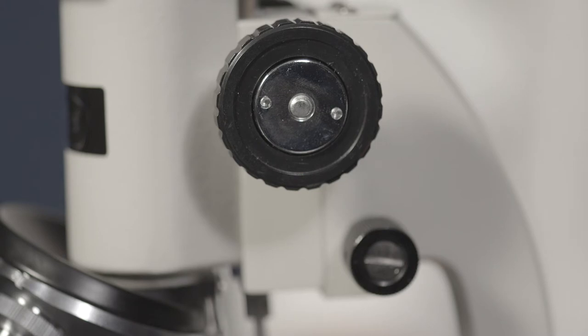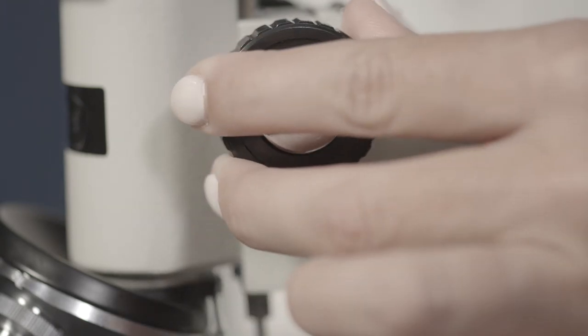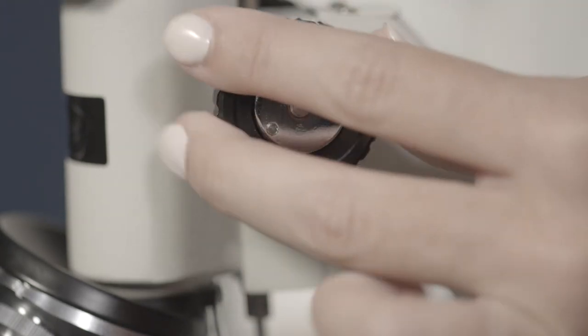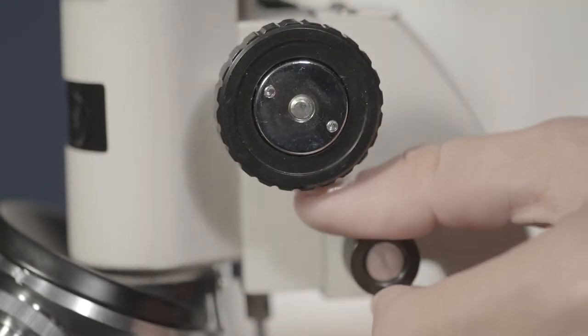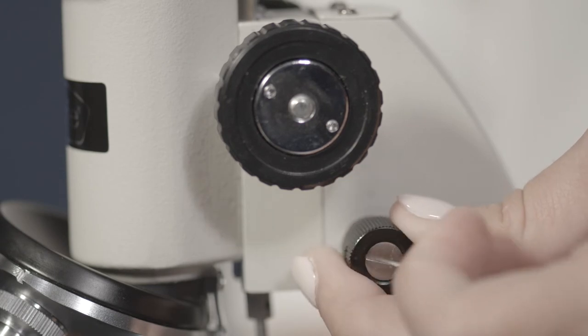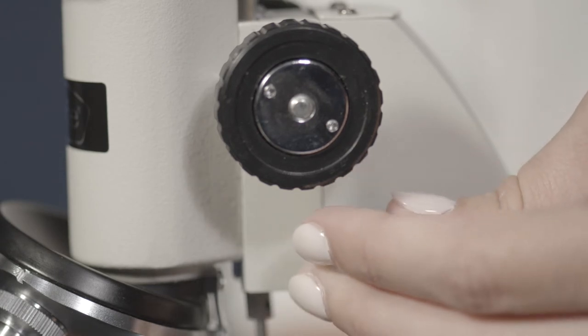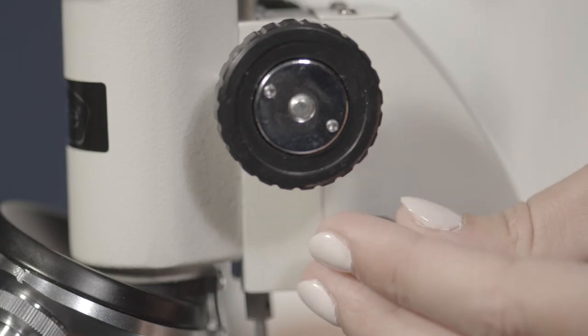The Wolf Introductory Microscope, item 591180, adds a separate fine focus control. This adds a step in the focus process, but increases accuracy when trying to obtain sharp focus while viewing at higher magnification levels.